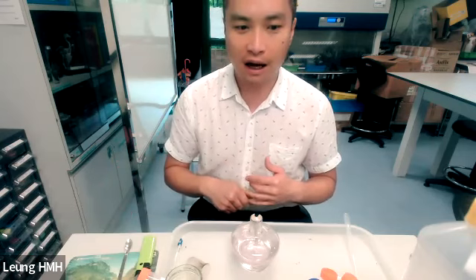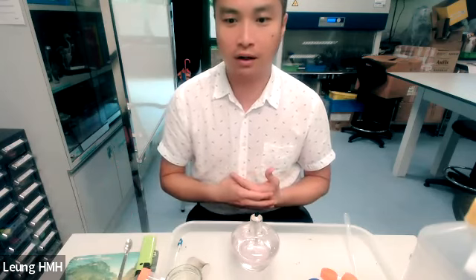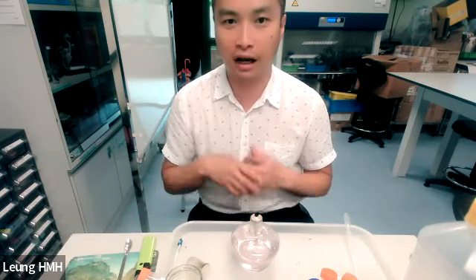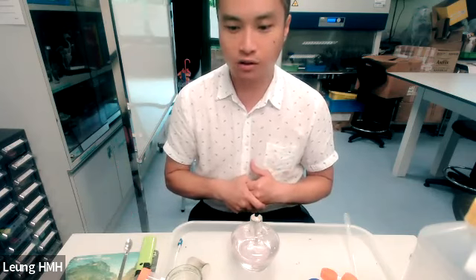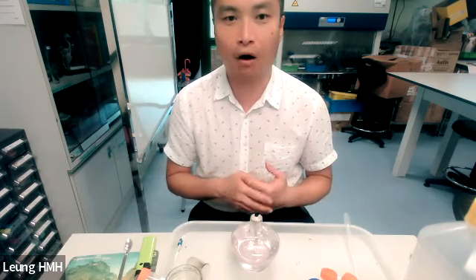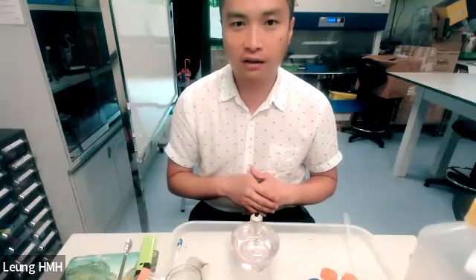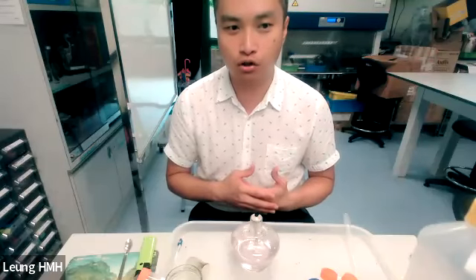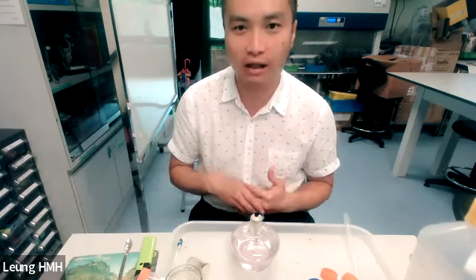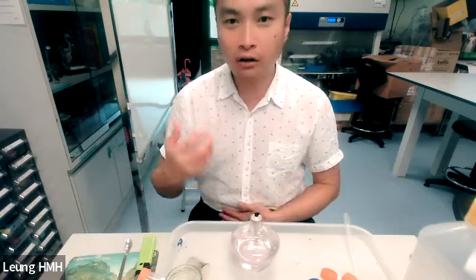So in this demonstration, I try to do the experiment and you need to take a record of the experiment, so please pay attention to the description and also the resulting solution. You need to take a look at the resulting solution so that you can get familiar with the product of biodiesel.